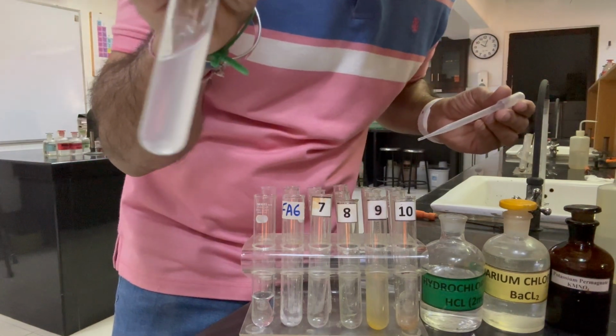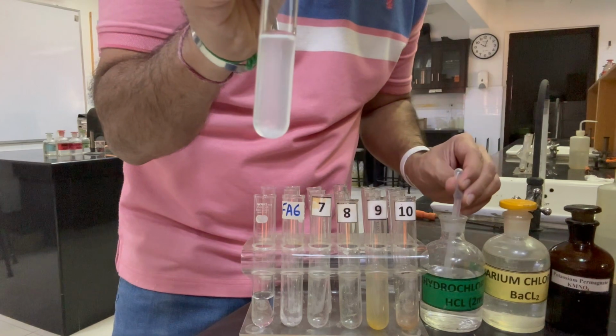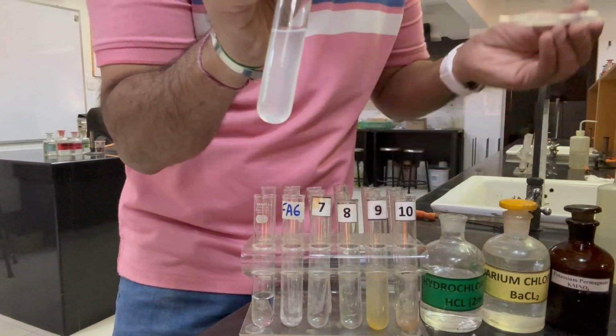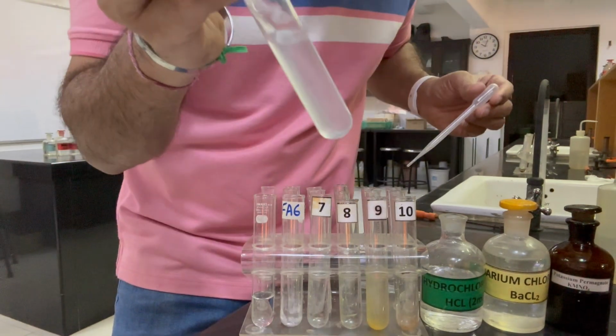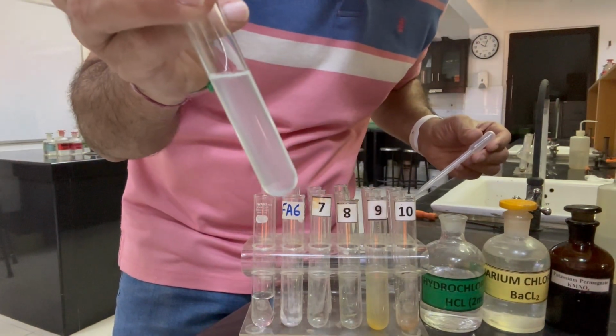So the color you can see is getting lighter, and if I add a bit extra, now those precipitates are dissolving.